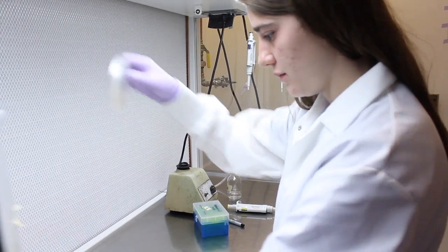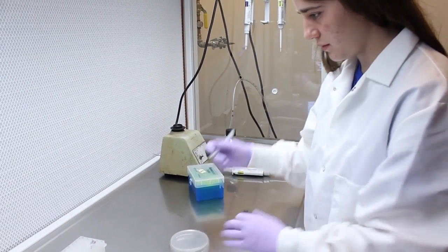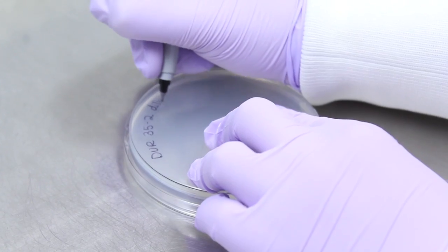Label a BCDA plate with the sporophyte number, your initials, and the date. Once again, make sure to spell out the date so that it doesn't get confused with the sporophyte number.